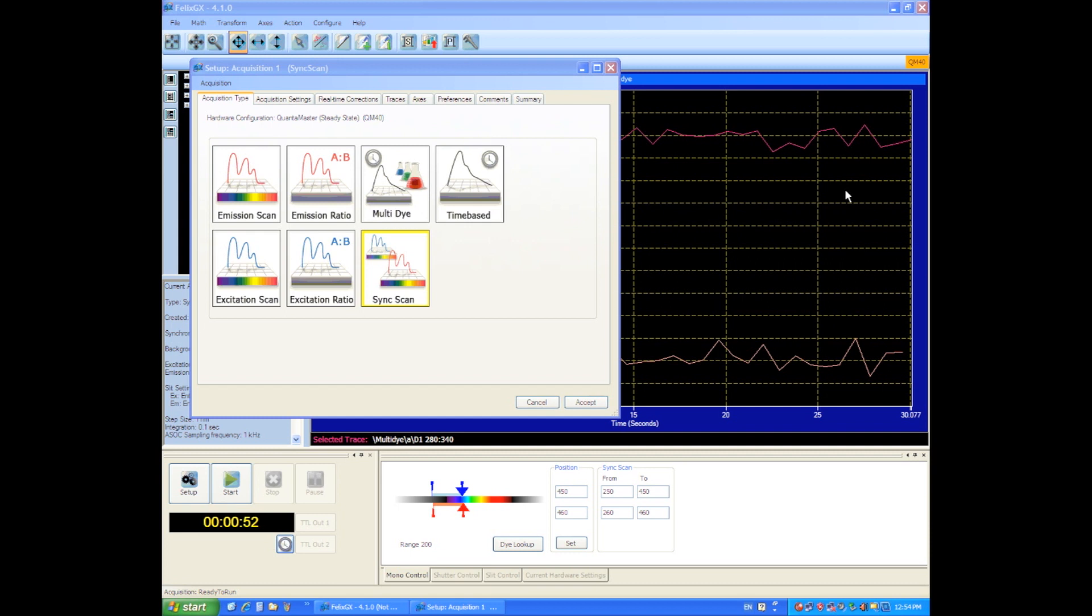Welcome back. I'd like to show you a unique scanning mode on the Quantum Master System. It's called a synchronous scan mode.